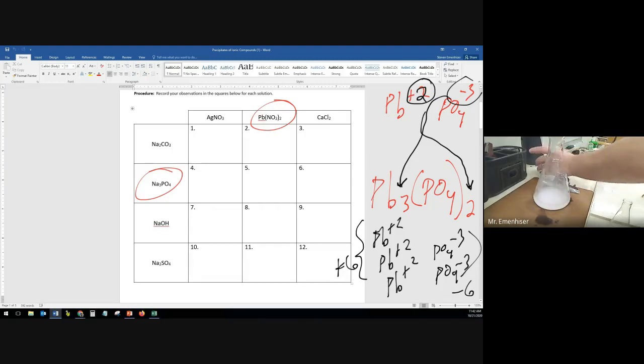And let's do the same thing with this one. Try to get all that solid. Oh, and it's draining slow. Okay, well, I'm going to let that sit out. I'm going to have to move it over to 5, though, because I want to keep it labeled. Let's move it. There we go. I'm going to let it settle out there.